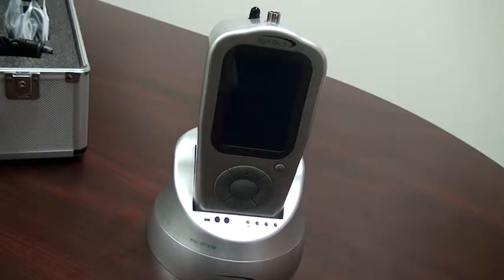The HPC-600 is the first and only hybrid handheld particle counter offered on the market. It combines many features of portable particle counter functionality, including a built-in printer and high-speed USB remote data sampling and downloading from a remote computer.